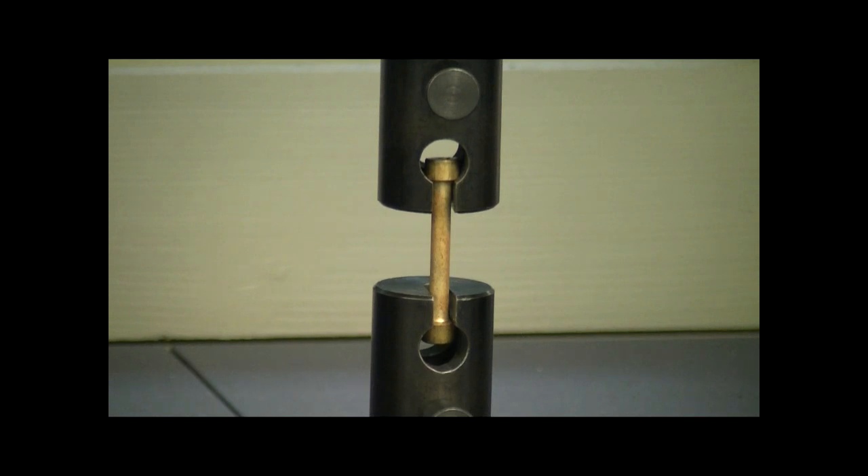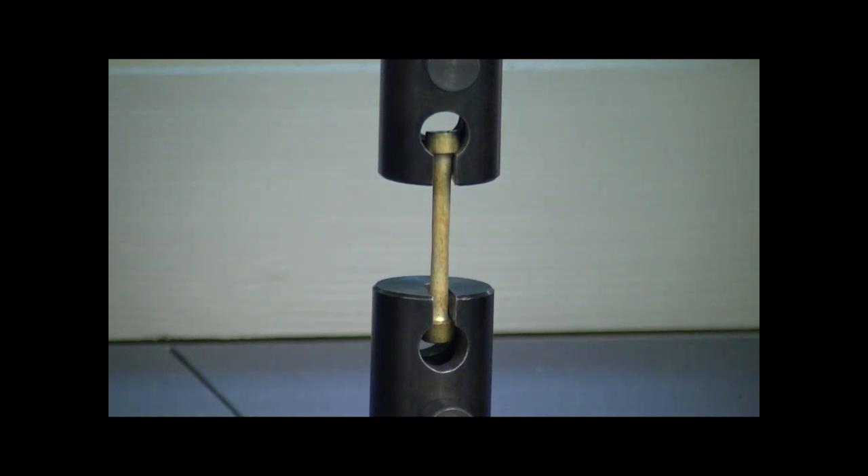You'll notice that the test piece is elongating — you can actually physically see it elongating. We know it's getting closer and closer to the point where it's eventually going to fail. The chucks are moving at a very slow speed, but sufficient to place the test piece under a load. Just keep a close eye on the centre of the sample. You can see it narrowing; you can see the cross-section reducing. It's getting closer and closer to failure. There it goes — necking in at the centre.